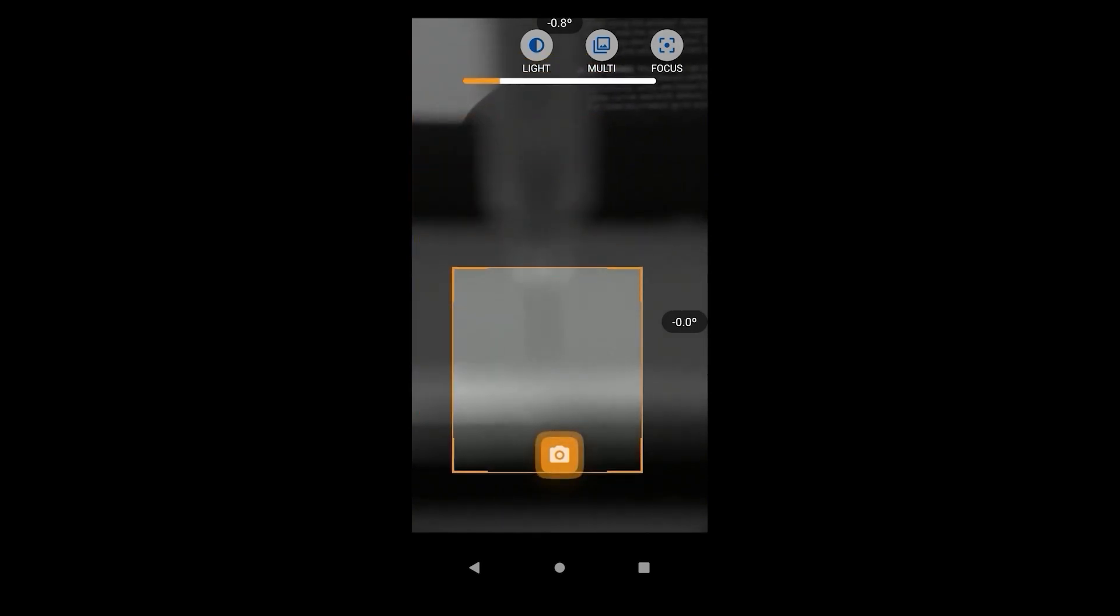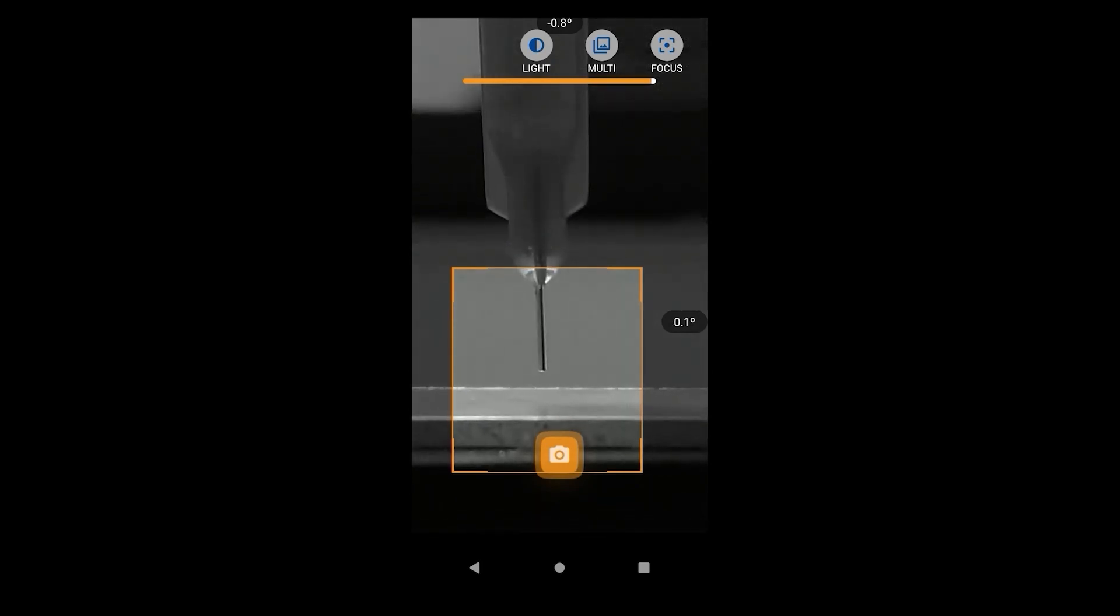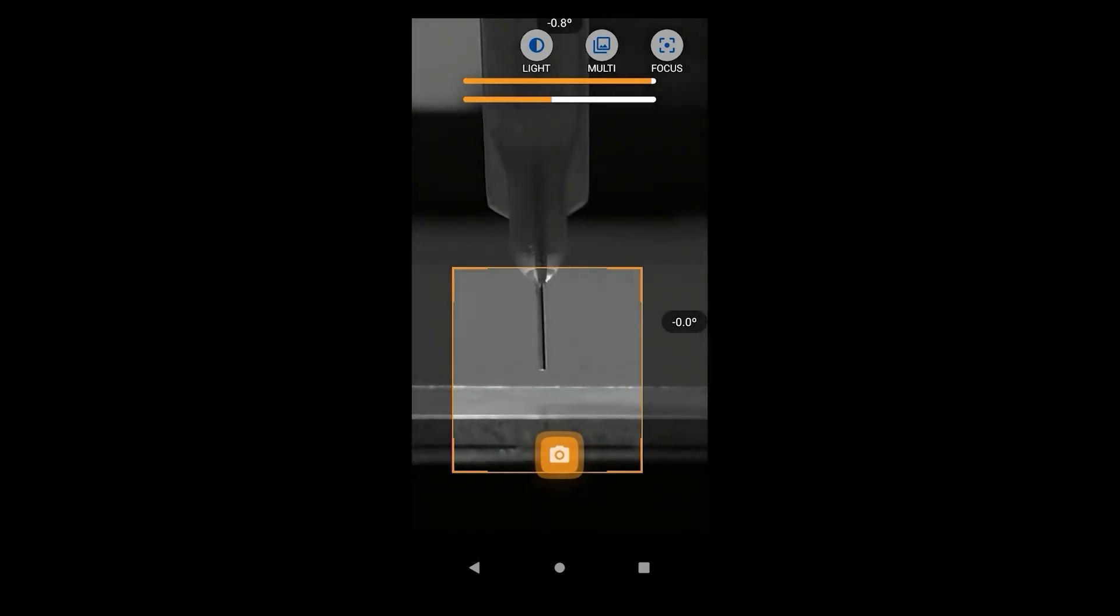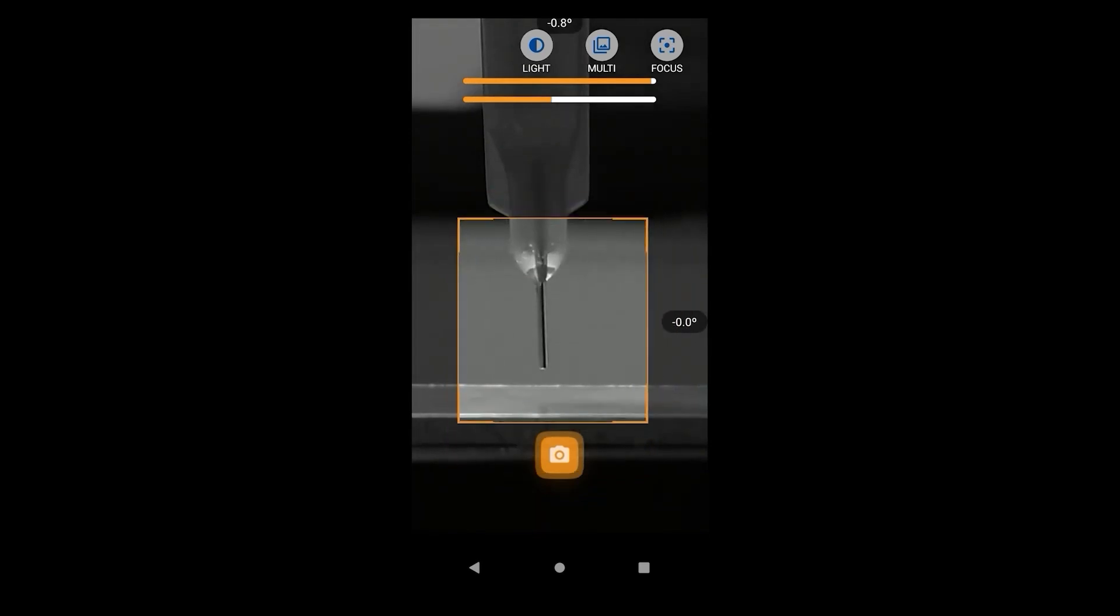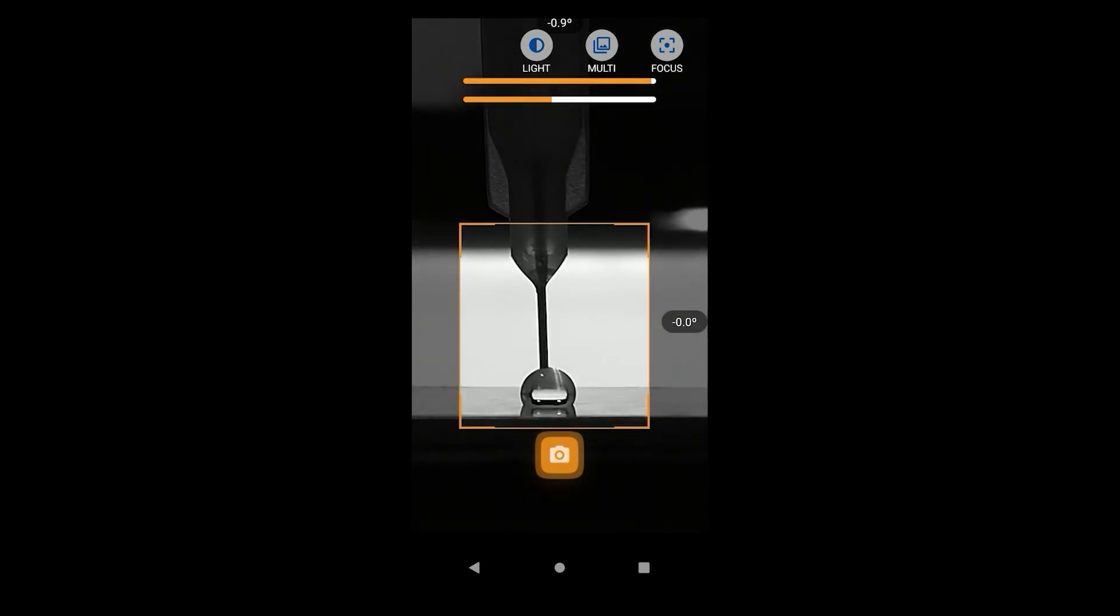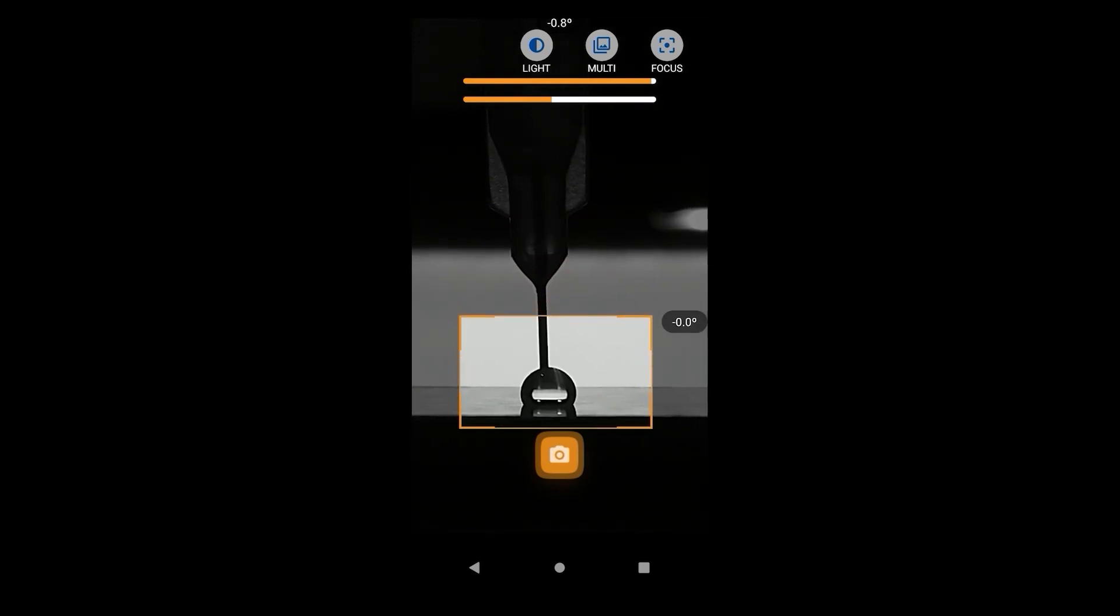We manipulate the orange box to select the area of interest. Use the focus slider to focus on the droplet to get the best results. The focus slider should ideally be as close to the maximum value possible. The aim is to be as close to the droplet as possible without losing focus. Adjust the LED backlight and the phone's light to get the best possible contrast between the droplet and the background.